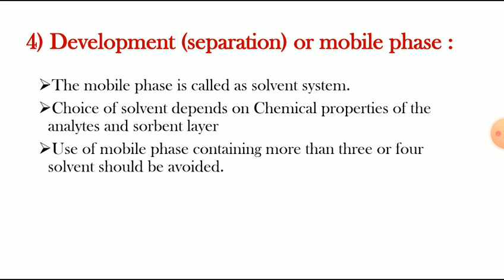Use of a mobile phase containing more than 3 or 4 solvents should be avoided. That means we have to avoid many solvents while preparing the mobile phase.